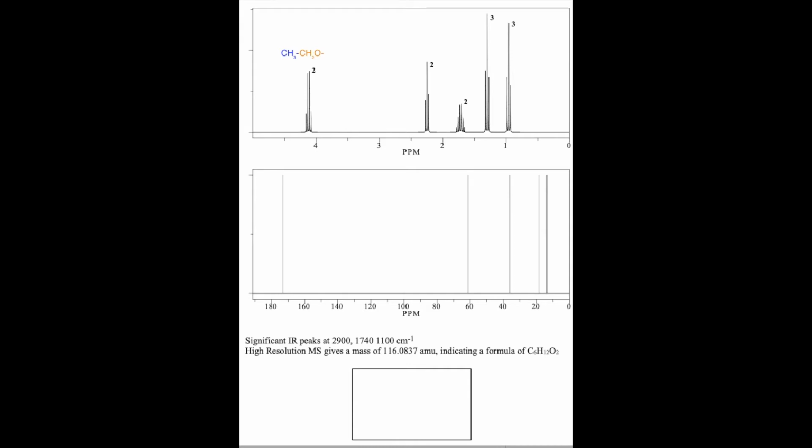Now here's the thing. I already know where one of them is. That blue methyl group that I implied to exist next to that CH2 quartet, that orange CH2, I knew that that existed. Remember that blue CH3 is not actually what that quartet at 4.1 ppm represents. We're implying it exists because of the multiplicity, that quartet. Well, if you look, I have two generic CH3 peaks, and they're both triplets. And whatever's next to that orange CH2 will be split into a triplet, right? Two neighbors plus one is three. And that means it'll be a triplet.